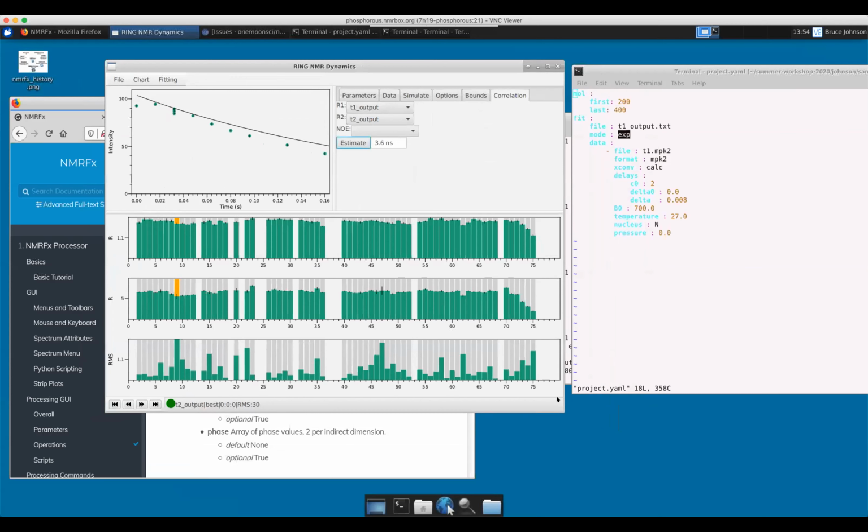Hi, Bruce. Just kind of an obscure question, probably. So when you go through different residues, suppose for whatever reason, for a particular residue, I find a multi-exponential or a bi-exponential kind of behavior, and you do have a way to simulate, is there a way to then say, okay, fit this particular peak for whatever crazy reason to those two T1 values or something? Yeah, the short answer is no. Okay. The longer answer is we should.